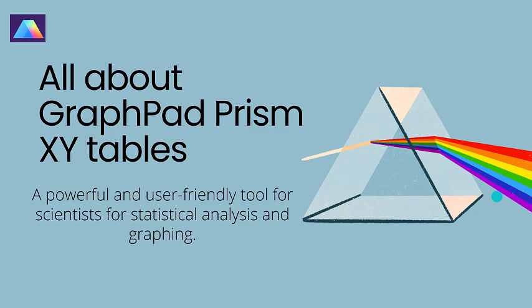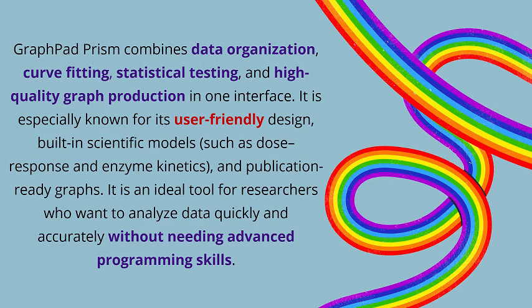In today's video we're going to talk about GraphPad Prism XY tables. First of all, we need to know what exactly is GraphPad Prism. Well, it's a powerful and user-friendly tool for scientists like you and I for statistical analysis and graphing. Let's go a little bit more through it.